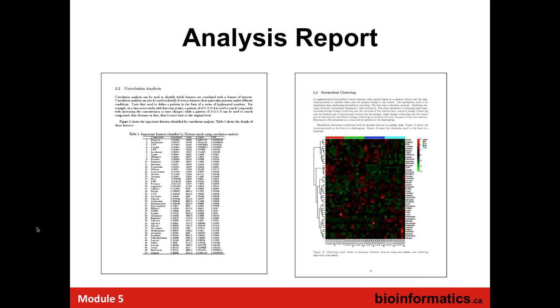It tracks your workflow, and a lot of people are trying to develop workflows so that there is that level of reproducibility. If you do this ad hoc with a whole bunch of different programs, I used Excel for this, I used another program over here, and I used another one over here, perhaps in your paper or write-up or thesis, it'll tell you in some detail, but I think the key point is to capture all of the parameters that you used and have that record. If someone wanted to reproduce your work, ideally you'd like to have that parameter file available.